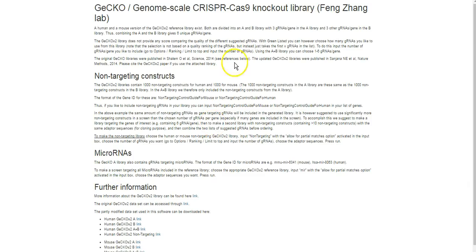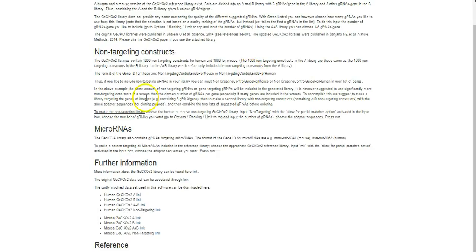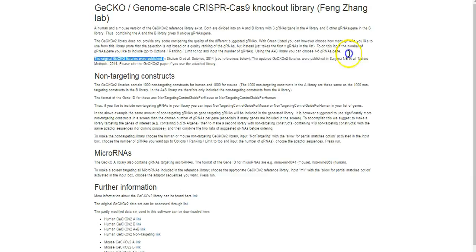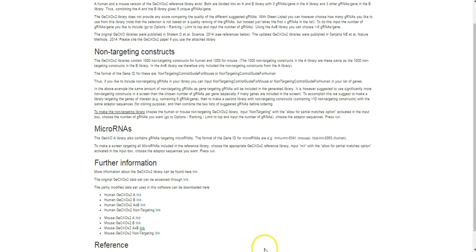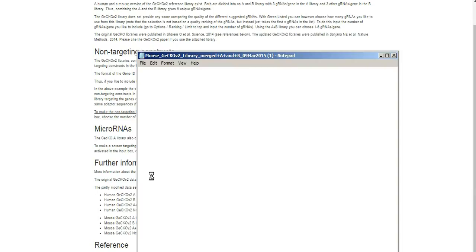This is the GeCKO library, version 2, the second generation — it comes from the Feng Zhang lab. On this page you can see the publications that these libraries are coming from, so please cite the appropriate papers if you use them. You can download these libraries if you want — they are fairly large so it'll take a while. As it downloads, you can open it. These are fairly large: six gRNAs per gene, roughly 20,000 genes, plus some controls — approximately 120,000 gRNA sequences in total.